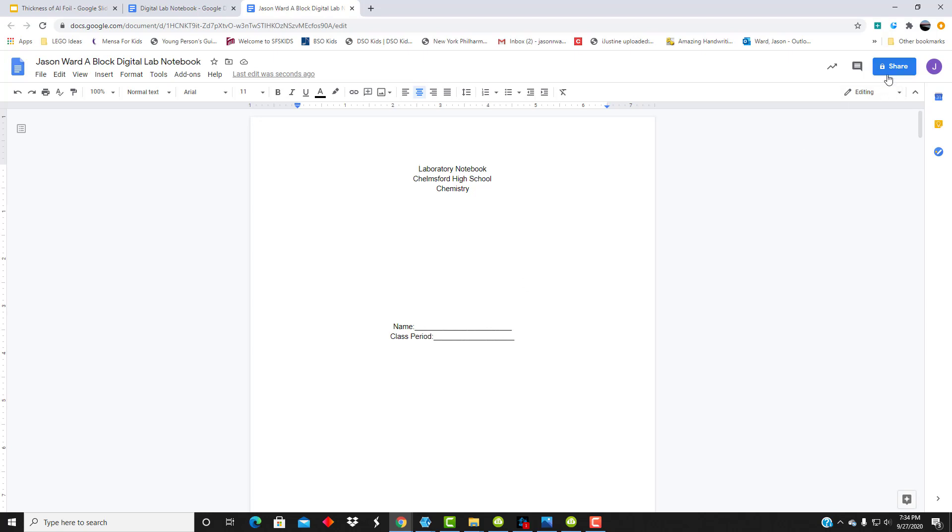So once you've done that, the next thing I want you to do is go over to this blue button. See how it says it's private? Well, you need to share it with me. That's the first thing you need to do.